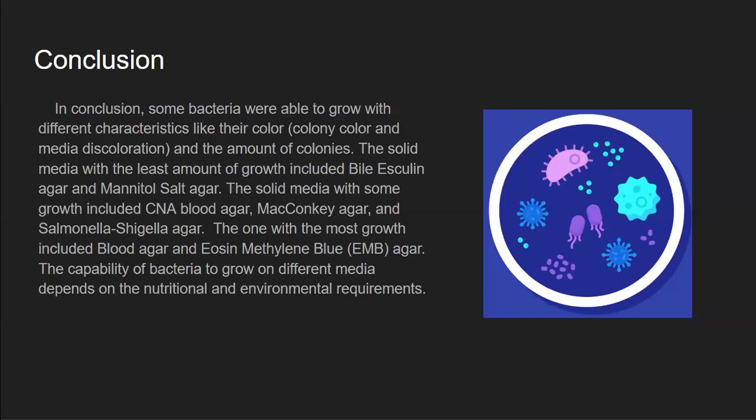The capability of bacteria to grow on different media depends on the nutritional and environmental requirements.